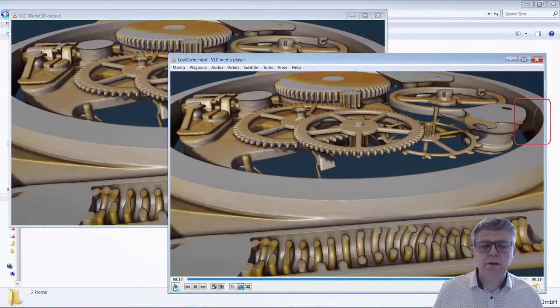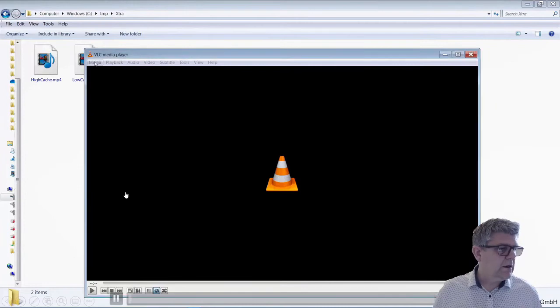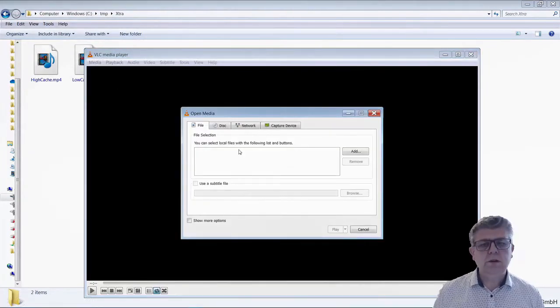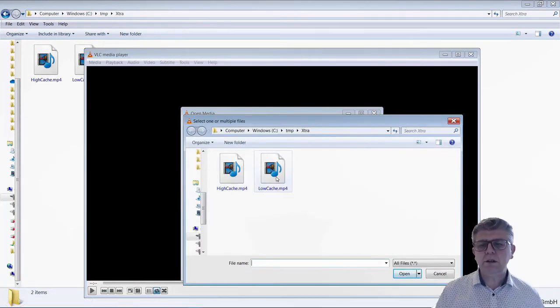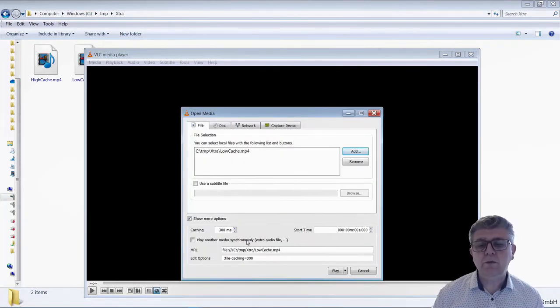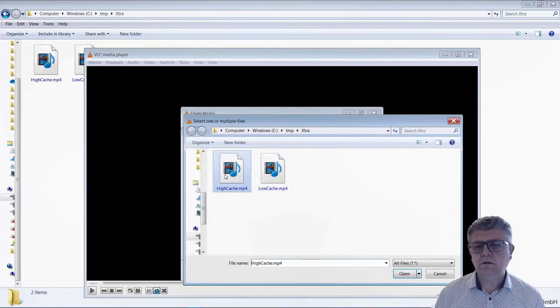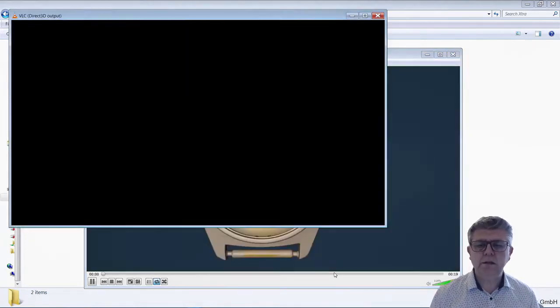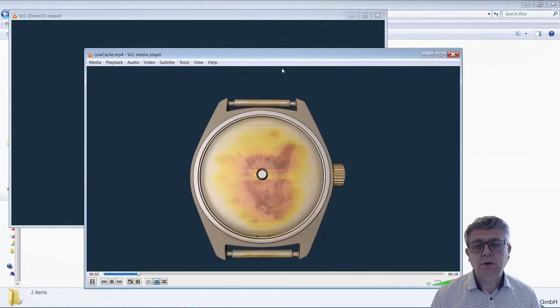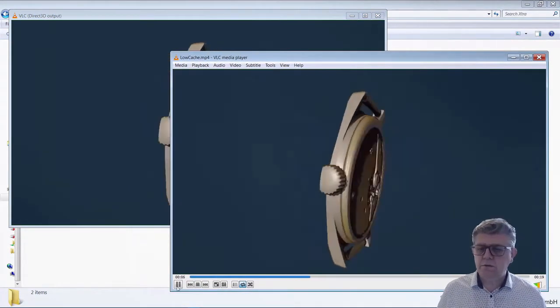So this is the video. What I did, I created my videos with the 2 configurations, with low memory and high memory in the preferences. I recorded on disk, and now I'm going to play them with VLC, using a nice feature of VLC. You can actually play 2 videos synchronized between them. You can pause, stop, move the window, so you get 2 windows synchronized with the 2 videos. It's pretty neat.